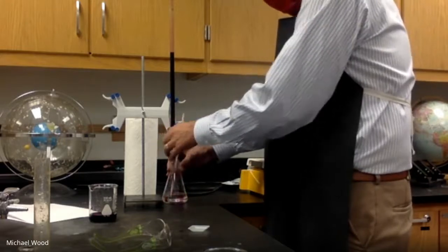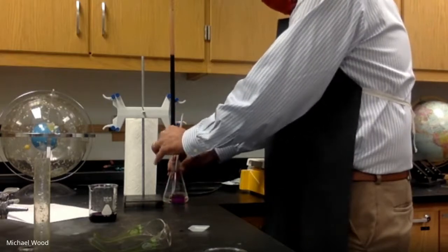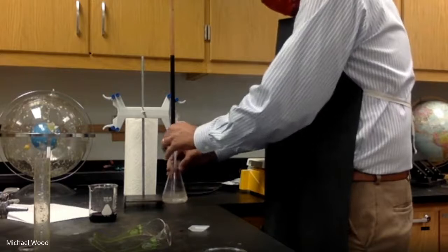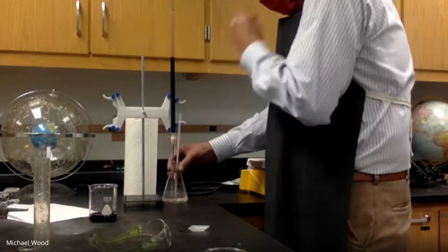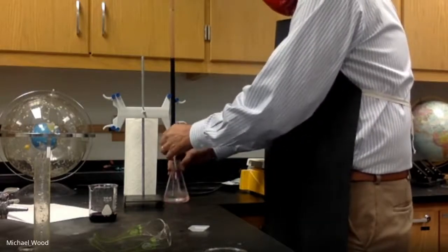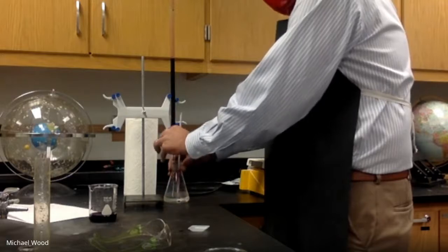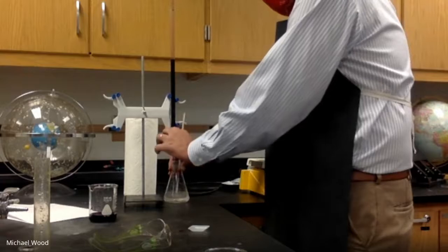I think I'm getting pretty close. Trying to get to that faint pink color, almost there, I think. Close. And this is the advantage of the buret. You can add just a little bit at a time.